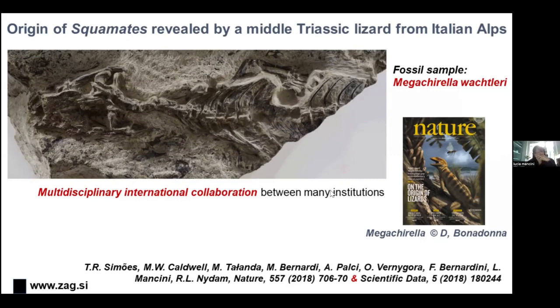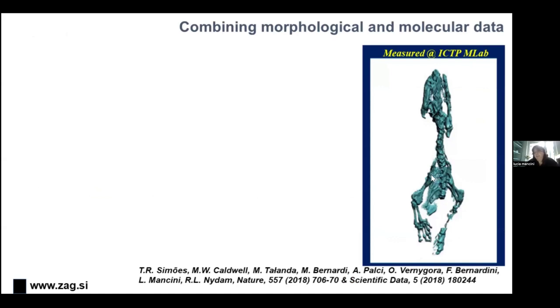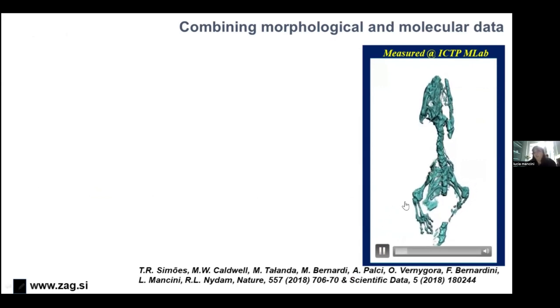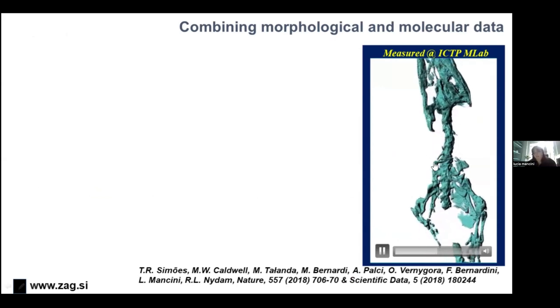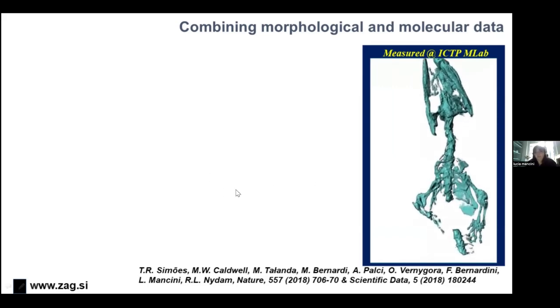We had the chance to publish this paper in Nature, and it was selected for the cover because, when it was published, it was the oldest reptile ever discovered. Even though this reptile was discovered more or less 20 years ago and analyzed with different techniques, it was never possible to virtually extract the fossil from the rock, and so to visualize the part that was embedded in the rock. Thanks to CT, we could virtually extract the reptile from this rock, and we could also analyze the face that was hidden from direct visibility.